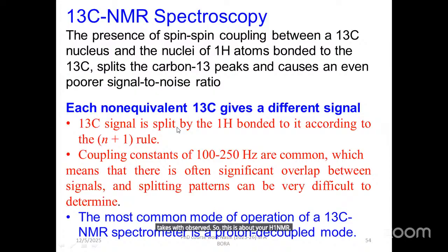Now, our topic is NMR. Either I can go to C13 NMR or I can go to the simplification of H1 NMR. Right now I don't know whether we'll be meeting again, whether our lecture will be there or not, but roughly I'll just stop. Just now we spoke about H1 NMR, and there is another NMR, that is C13 NMR, which is equally important for us to get the structural information about the molecule.